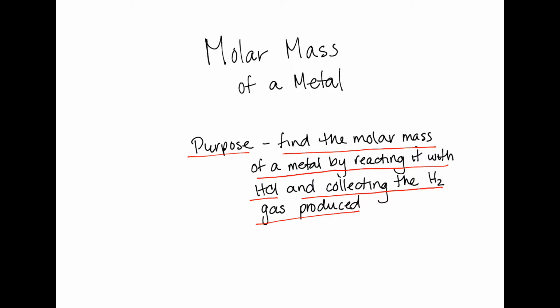Now, if you recall, metals react with hydrochloric acid. I'm just going to use aluminum as an example here. When they react with hydrochloric acid, it's a single replacement reaction. The aluminum takes the chloride, and because aluminum makes +3 charges, chlorides make -1 charges, when we put them together, they would make aluminum chloride, like this. And then the hydrogen is going to be left by itself, but hydrogen is diatomic when it's pure, so we'd always get H2.